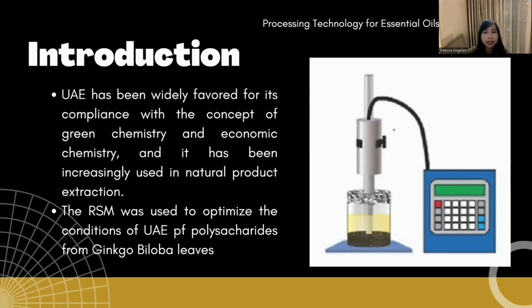Meanwhile, it is simpler and more economical than some emerging extraction methods such as microwave extraction, supercritical fluid extraction, enzyme extraction, and etc. The principle of ultrasound-assisted extraction is based on the ability of ultrasound to produce cavitation, thermal, and mechanical effects, among which cavitation is considered to be the most important factor. So, when the ultrasonic wave acts on the extraction solvent, the liquid in the solvent will be torn into many small cavities in some areas of weak tension, and these small cavities will rapidly expand and close so that a violent impact between the liquid particles occurs.